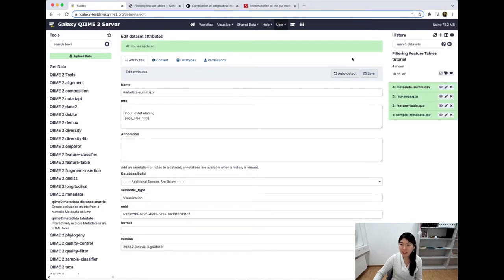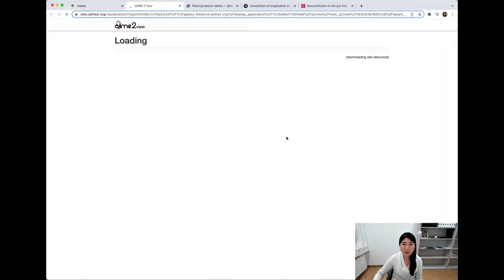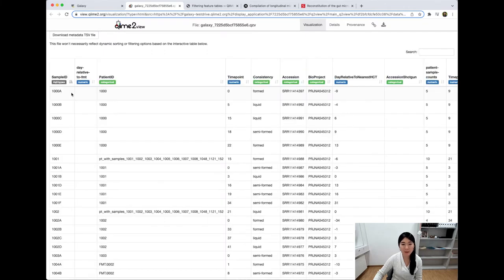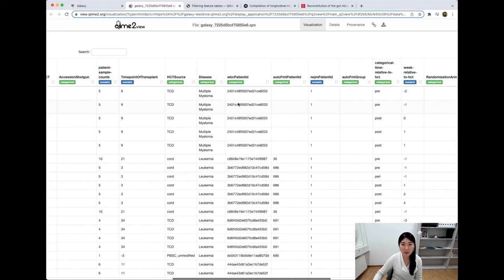And if we want to take a look at this visualization, we'll just click the name of the file to get this really nice dropdown, and we'll head down to view at QIIME 2 view. This is going to open another tab which lets us take a look at how QIIME 2 sees the metadata. We'll get this giant interactive table with different sample IDs, different patient IDs, time points, and all sorts of clinical data about the samples and patients.